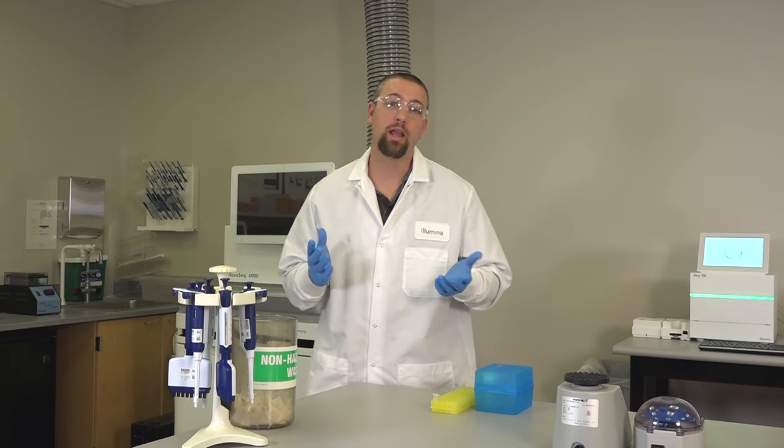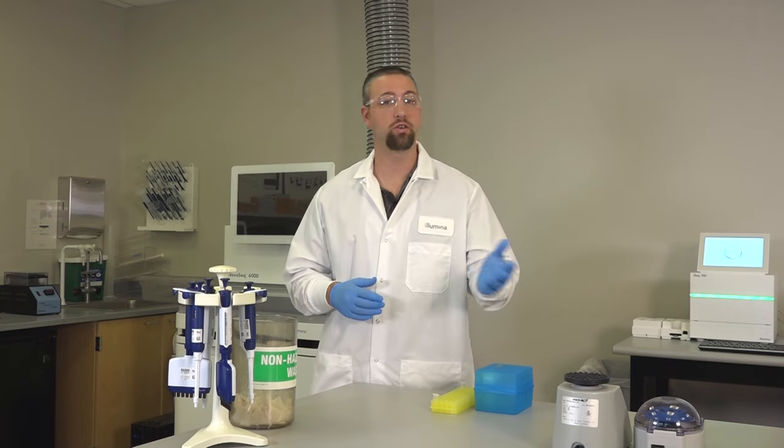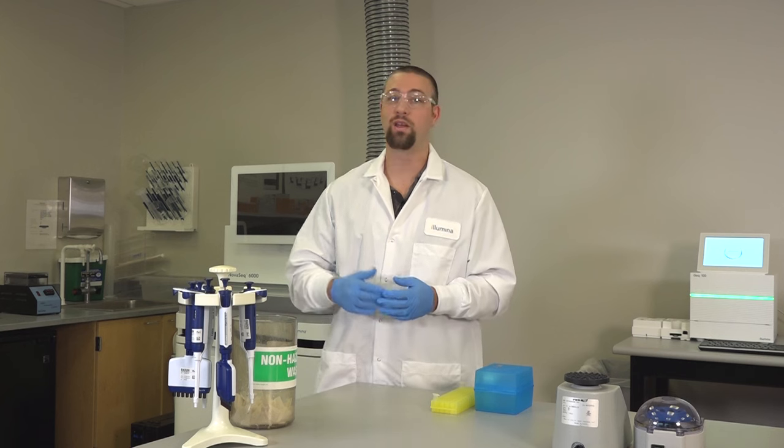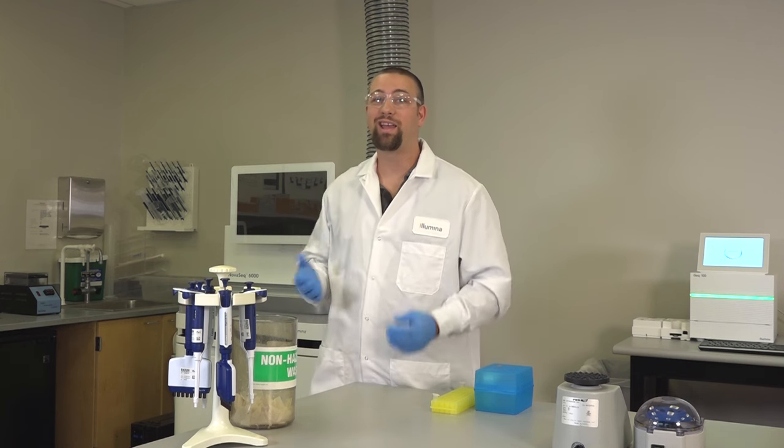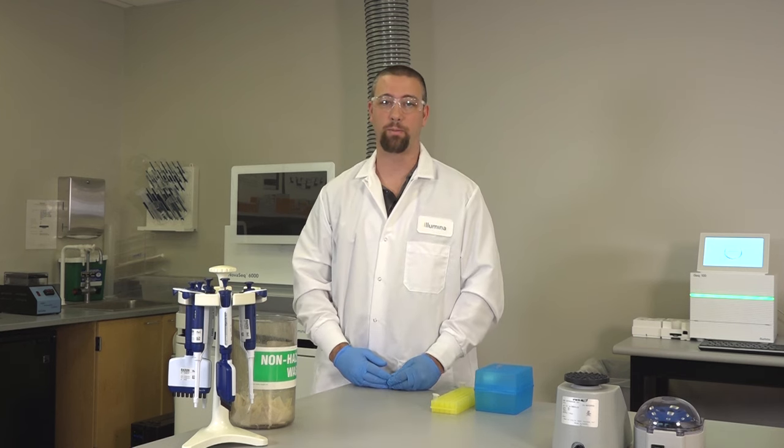Illumina sequencing and library preparations often require centrifuges, benchtop vortexers, pipetters, tube racks, heat blocks, and numerous other pieces of laboratory equipment.